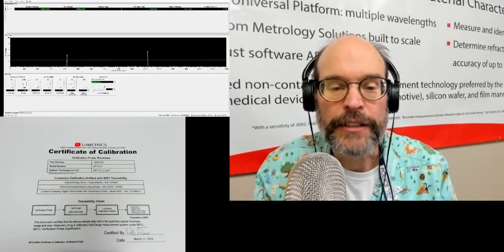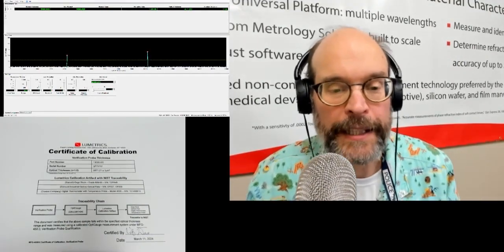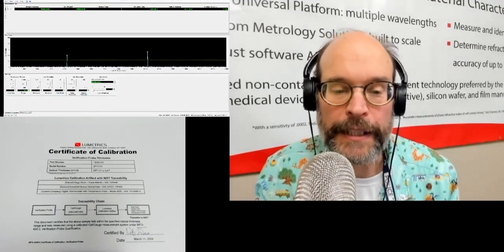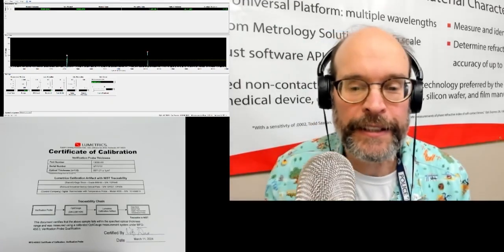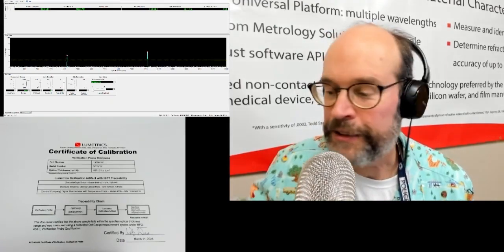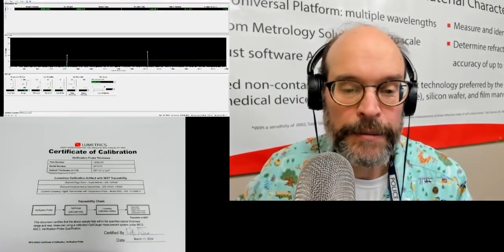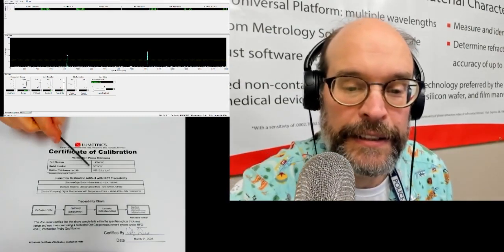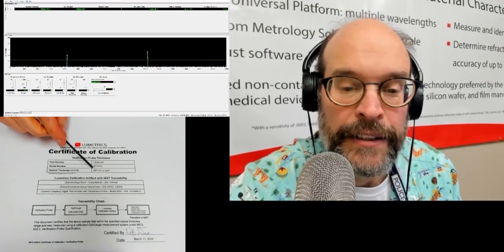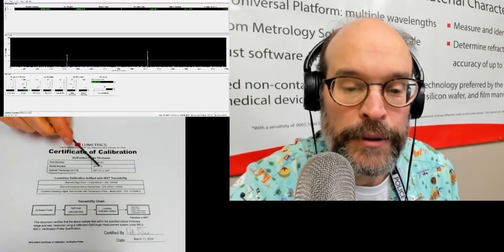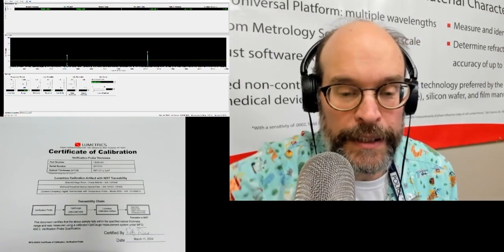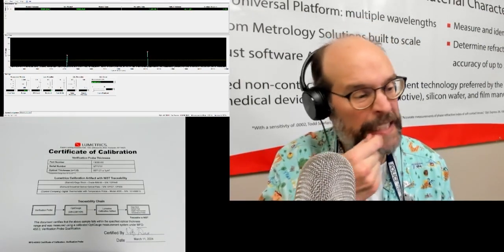All right, so I changed one of the cameras so that we're looking at the calibration certificate. And you can see that the calibration certificate has that 5971.21. And I think that's pretty much what we were getting.